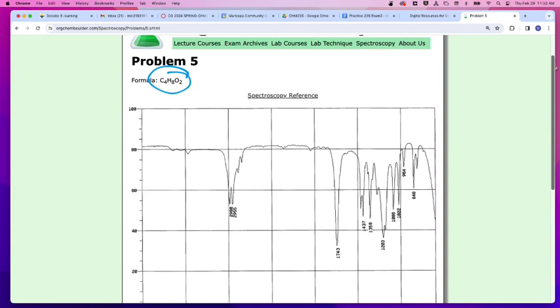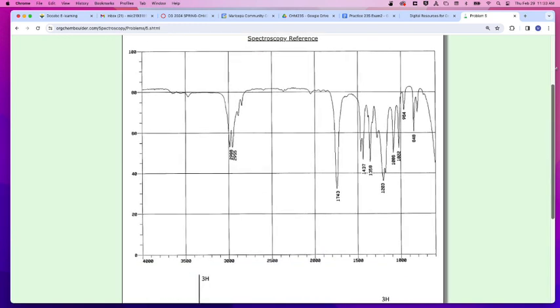The next thing we've got is our IR. What do we see within the IR? We should scroll down a little bit so that we can see that baseline, because that can help out. I would argue you don't need that, but it is helpful.